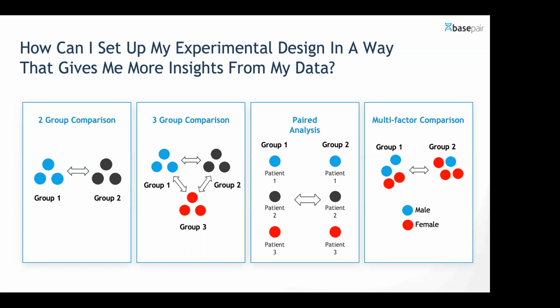And you can do that with what's called a paired analysis. You tell the analysis how you set it up. You tell it which samples correspond to the same patient, and this leads to a more powerful analysis. You have a greater ability to find differentially expressed genes when you give it that information, otherwise, if you don't give it that information, you often will get fewer significant results.